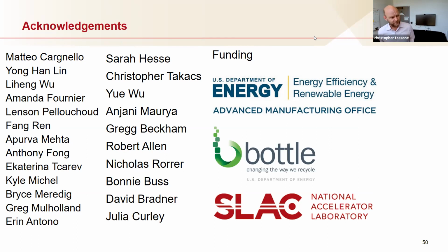The features that we left in, I think there was initially a total of 54 features that we had thought would be important. This was a mixture of things that we knew mathematically we could get out of the data, and things that, talking to various experts, they look for in the data to guess at fit parameters. Especially with people at facilities who can walk by an experiment and say, oh, you're looking at this material, and the question is, what were your cues? That's what we tried to build in.